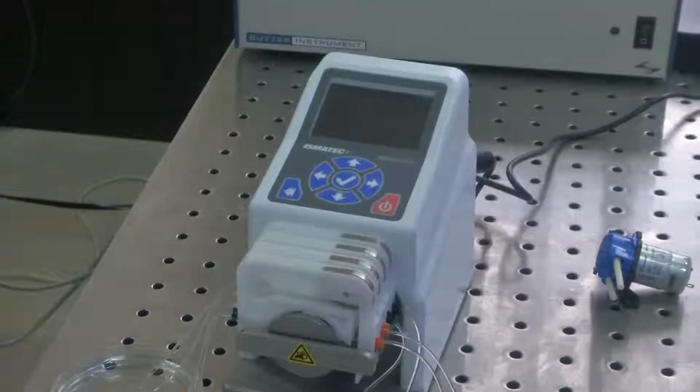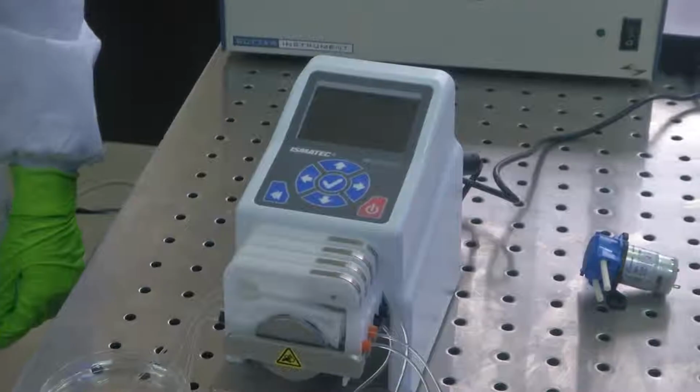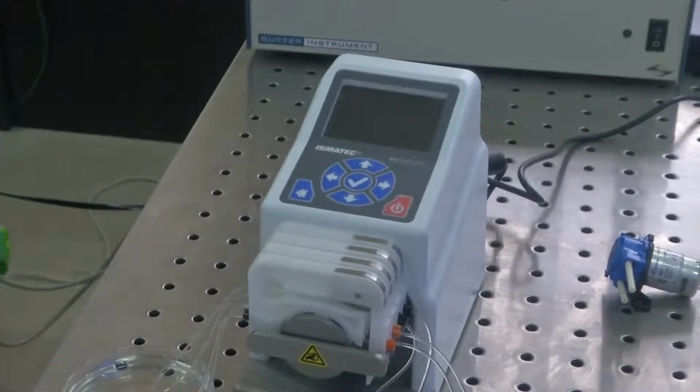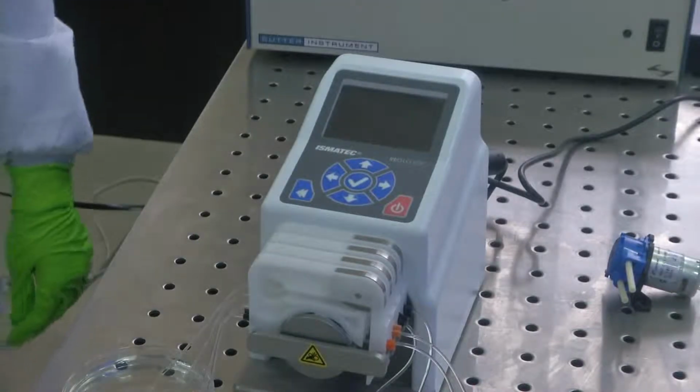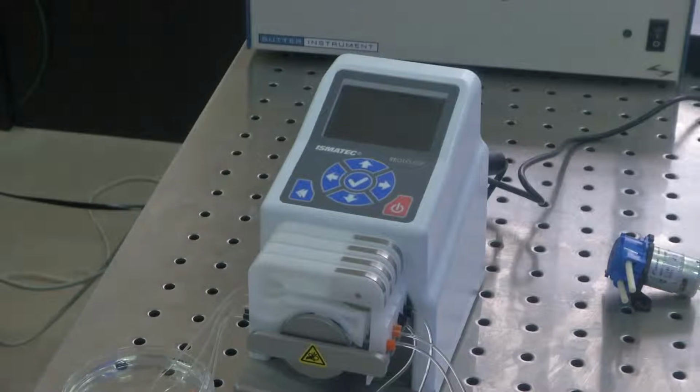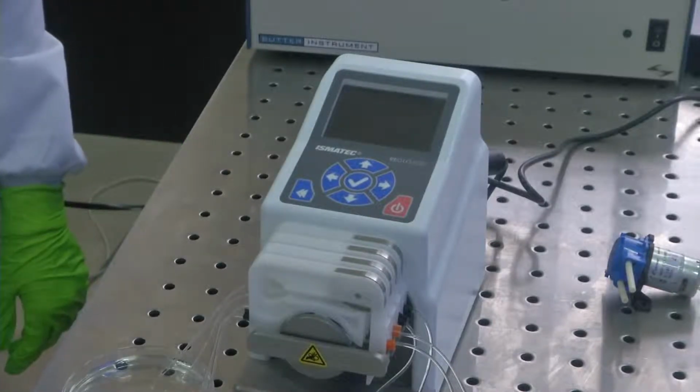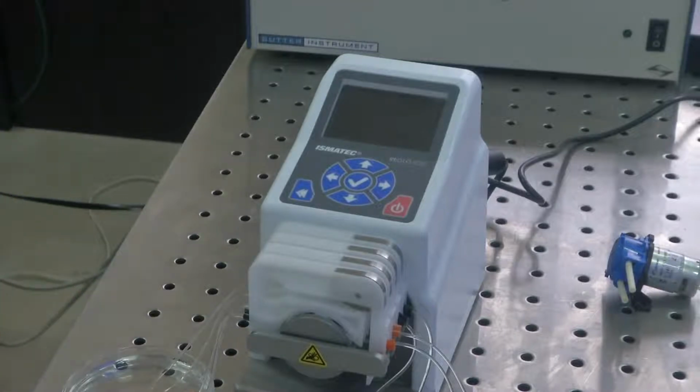Like we said, there were 2 variations of peristaltic pump, which is the hose pump, which operates at higher pressures, and the one that we have is the peristaltic pump, as you can see. There are rollers inside. Let's see how the peristaltic pump functions.